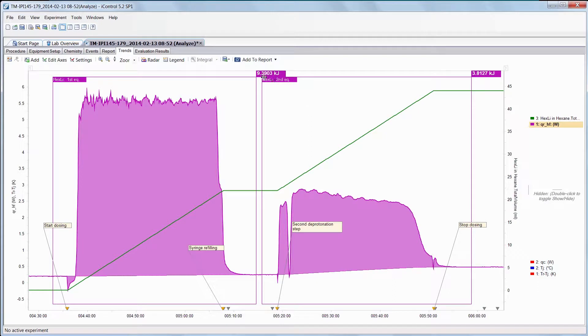So on the left side you can look at the first deprotonation step, one equivalent of hexylithium. When I look at this I conclude that the reaction is dosing controlled because the reaction heat goes up to a maximum stable level right after the start of dosing. It remains at a constant rate.